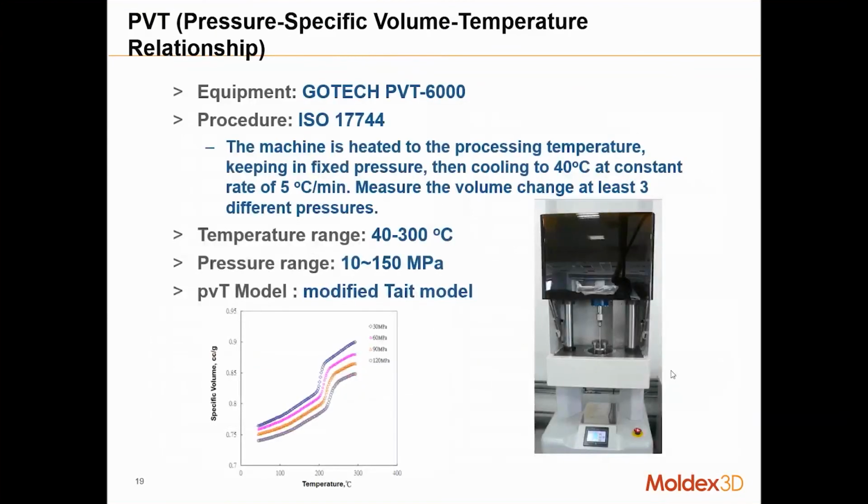And PVT is another very important tool in our predictions. I'm not going to go into too much detail, but here is a specific PVT diagram that covers different pressure settings and different temperature settings. What we can do is take the samples and measure them at different pressure and temperature settings, and our measuring process is by a cooling process.